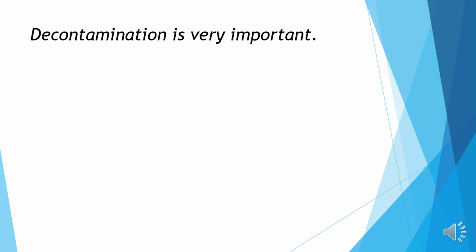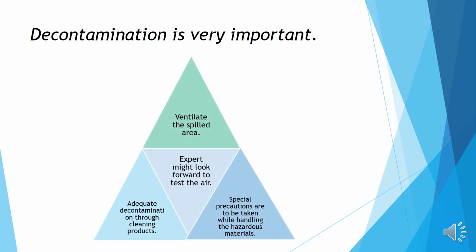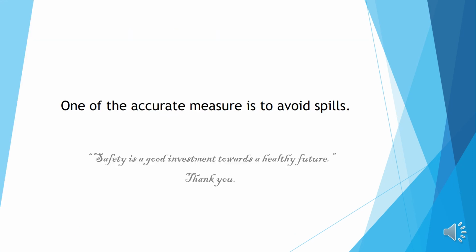Last but not least, decontamination is very important. The expert might test the air in order to make sure that the area is free of contamination. Avoiding spills is very essential, as the waste goes to water bodies and causes harm to aquatic life.